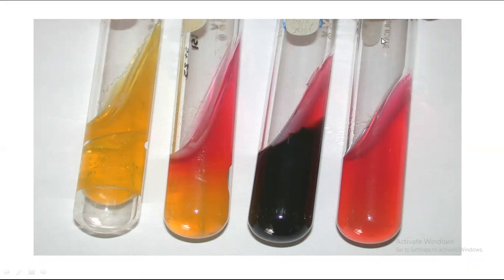We can get 4 types of results. The main thing is that we should understand what these results mean: if there is yellow color, if there is multi-color, if there is black color, or if there is no color, what does this mean? So basically the video is about this.